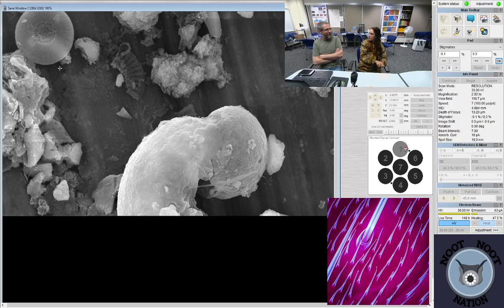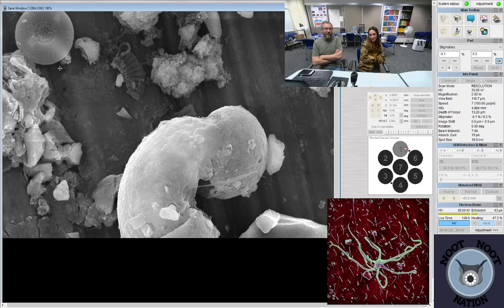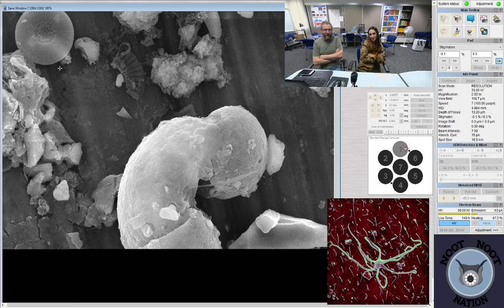Yeah. See, that's a pretty pollen. I mean, it's pollen. When I was trying to decide what I wanted to study, pollen was not one of the things I was thinking about. I was like, it's just gross looking. Some of them look pretty, though. Pine pollen doesn't.